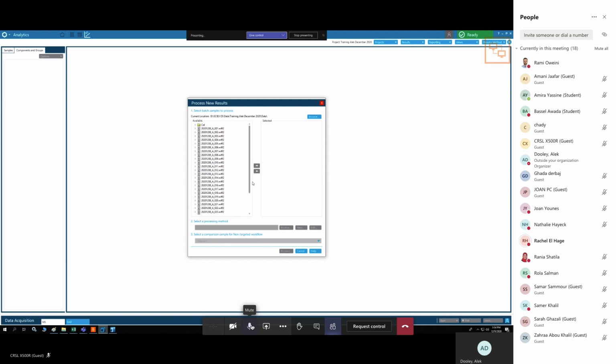I believe we can. I think so. If we're looking for triazines, yes. Right, okay, but what's different? There's one thing that's different. And you think what's the one thing that's different? It depends what to choose from purity or fit on the. Okay, processing, right. So if we look at the IDA data, it should be the same. IDA, okay, great. So what can anybody think of one other difference?